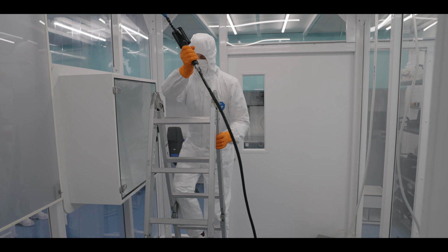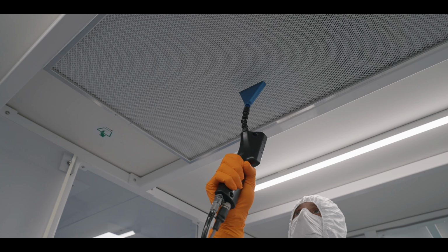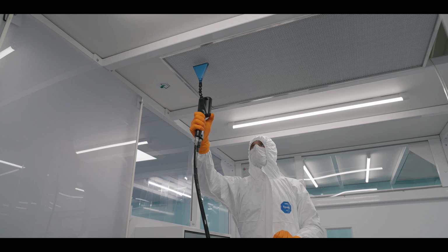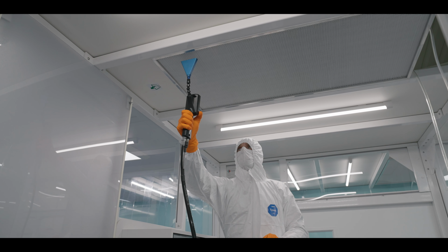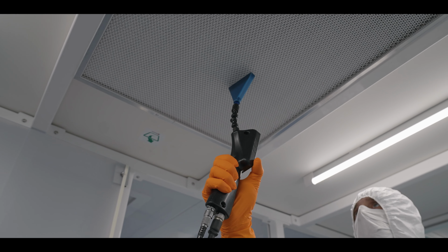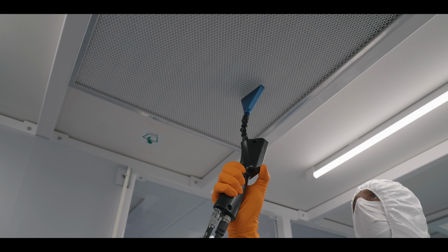onto the upstream side of the filter, and then measuring the penetration of particles on the downstream side of the filter using a photometer. This will then quantify the size of the leak if any is detected. A filter is considered to have passed the integrity test if the penetration of the aerosol is below a specified limit, which is usually 0.01% penetration.